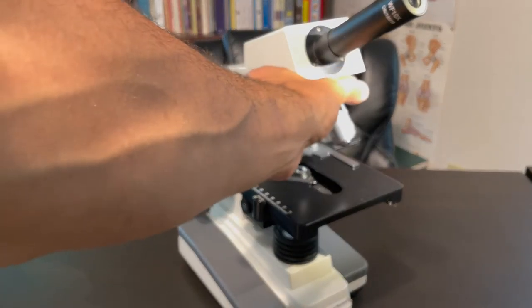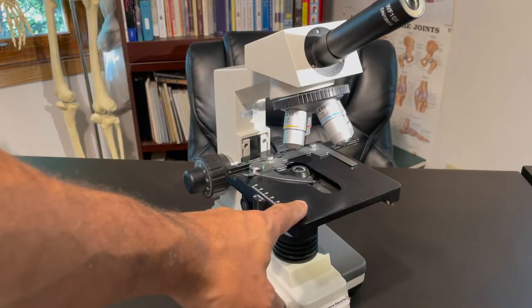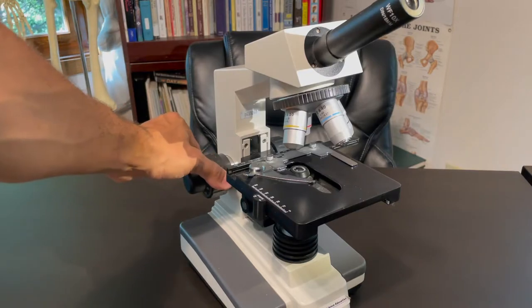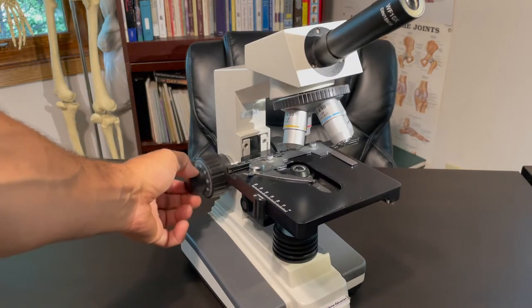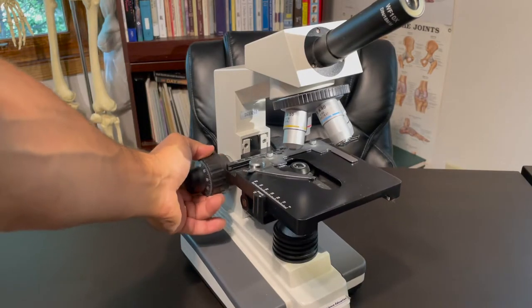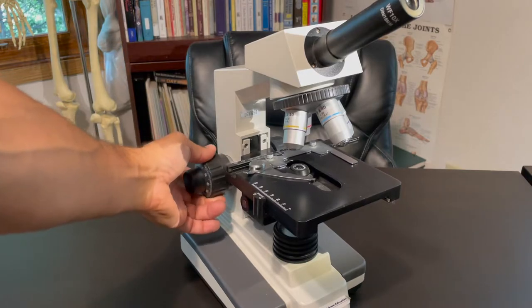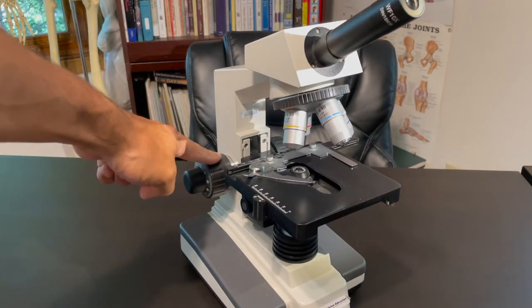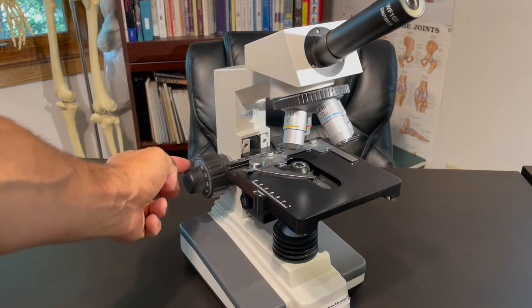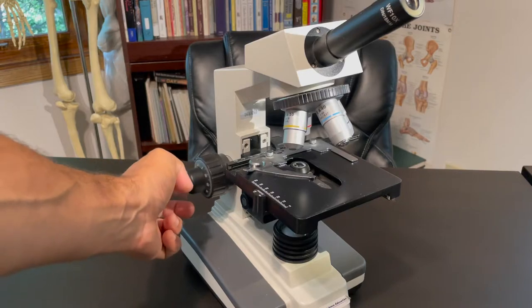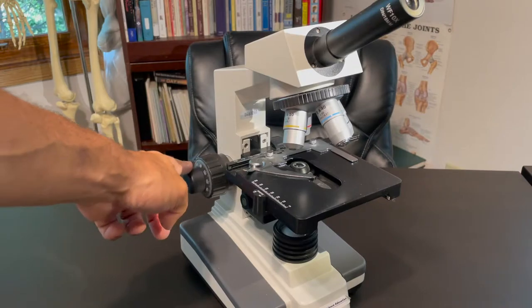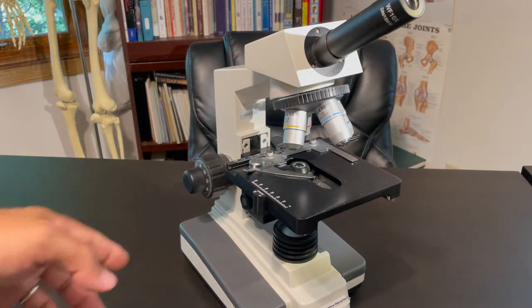We also have the stage right here. You have the coarse adjustment knob. That's this large one here. And you have the fine adjustment knob. If you spin even just a quarter of a turn, you can see how fast the stage moves up and down. That's using the coarse. You see that. However, you spin the fine adjustment knob and you don't really see, at least with the naked eye, the stage moving, although it is moving up and down. That's because it's a fine adjustment.